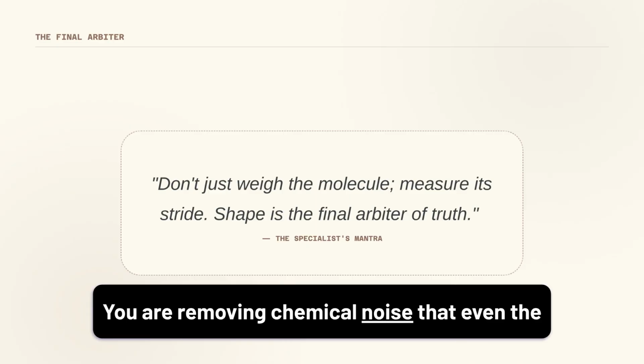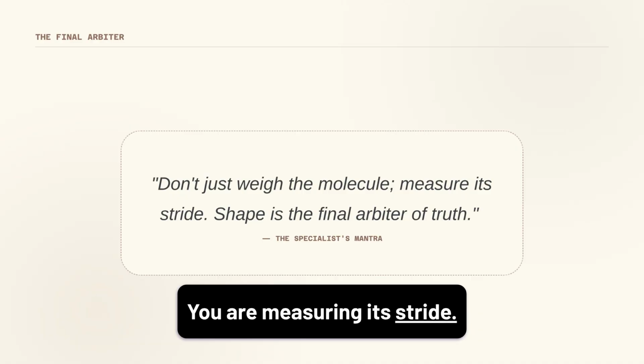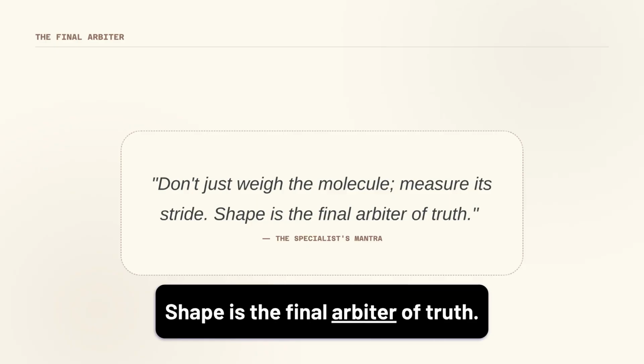You are removing chemical noise that even the best chromatography couldn't touch. You are no longer just weighing the molecule, you are measuring its stride. You are seeing the 3D reality of the chemical world. Summary: respect the shape. Shape is the final arbiter of truth.